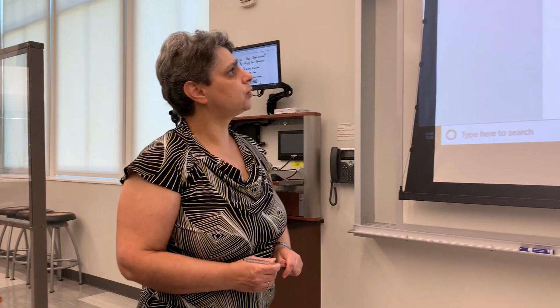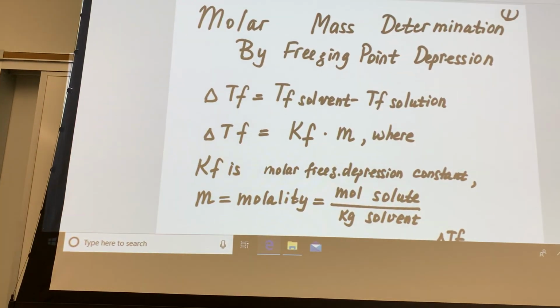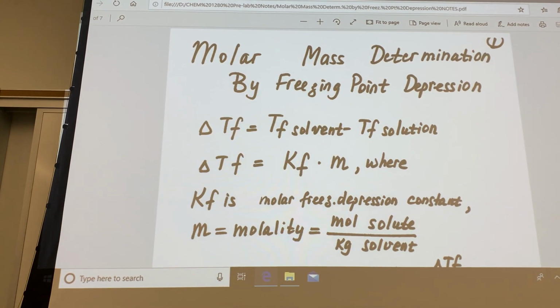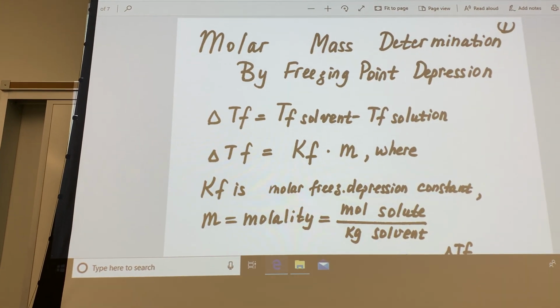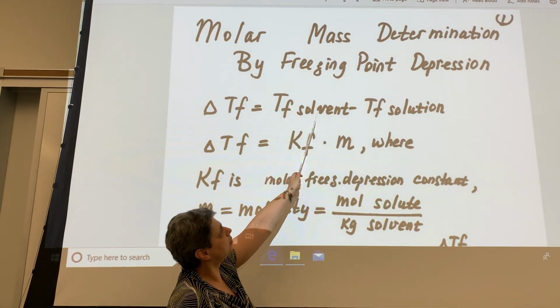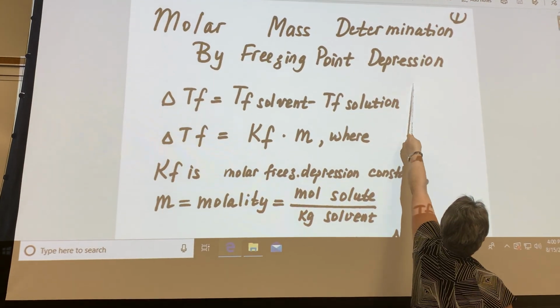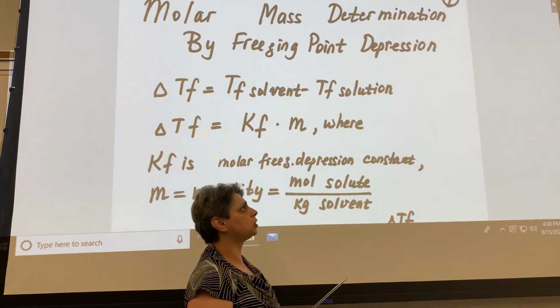Turns out adding solute to a solvent, creating a solution, alters some of these properties such as freezing point and boiling point. And that's why we're looking at these properties. So the goal of the experiment here is to find the molar or molecular mass of an unknown solute in solution. Freezing point depression is found as freezing point of solvent minus freezing point of a solution. The word depression is key here. Depression, of course, means lowering.